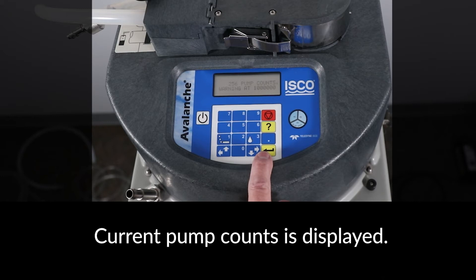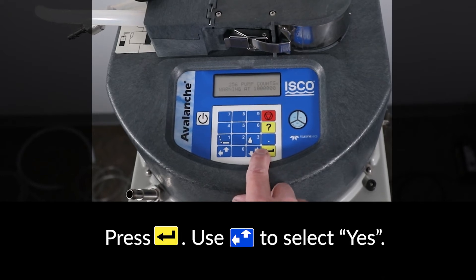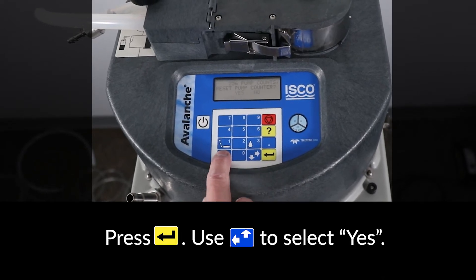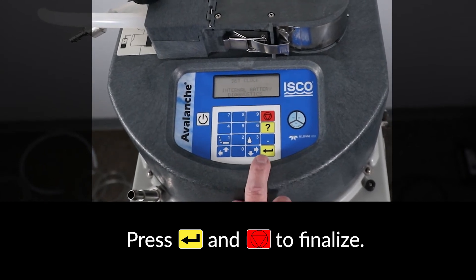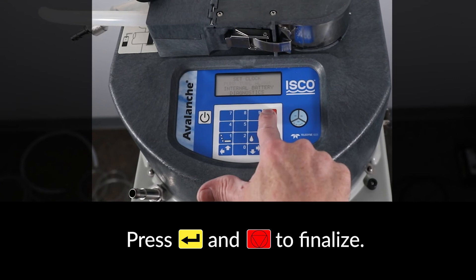The current pump counts limit is displayed. Press ENTER, then select YES to reset the pump counter. Then press ENTER and the red STOP key to finalize the reset.